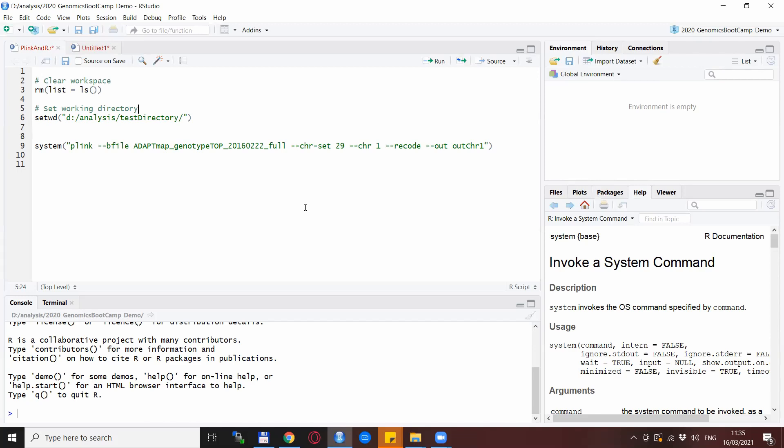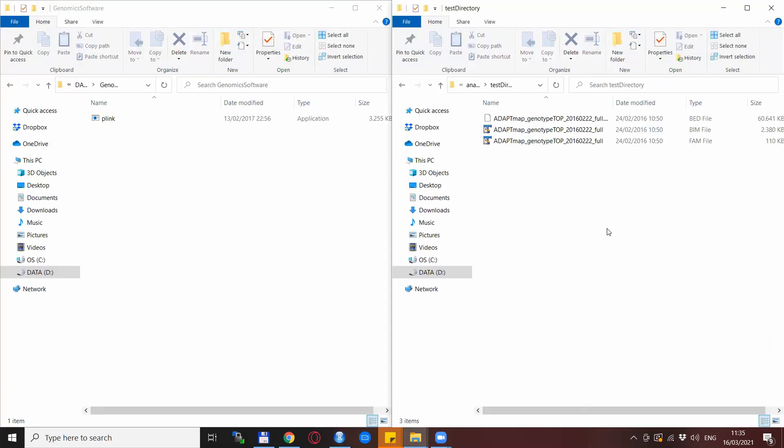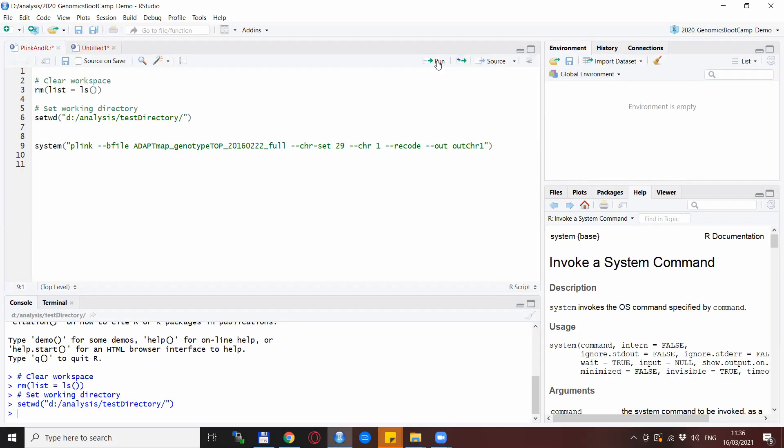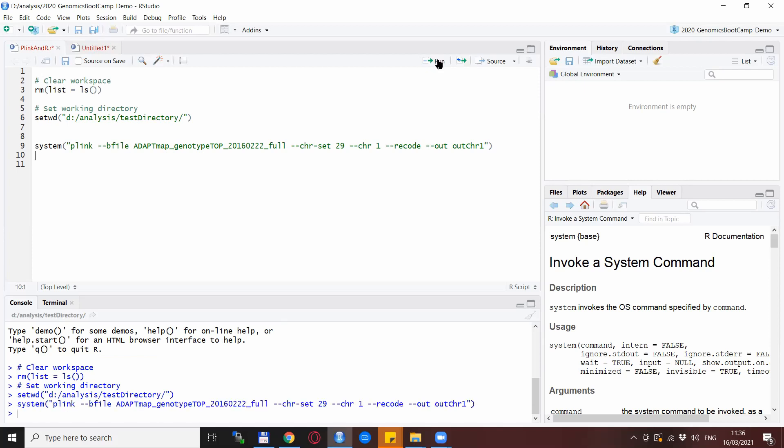So first, let's see what happens in the conventional case. I prepared a directory which is called test directory and this is just having the data inside and nothing else. So if you try to run this with the conventional case, you will get an error or nothing will happen but Plink will not run.